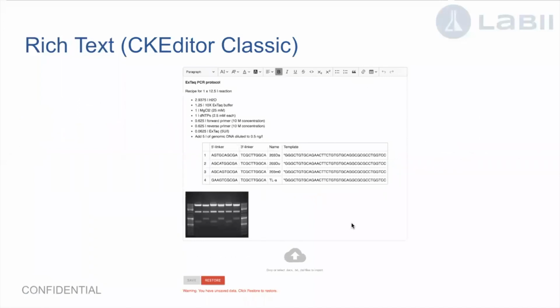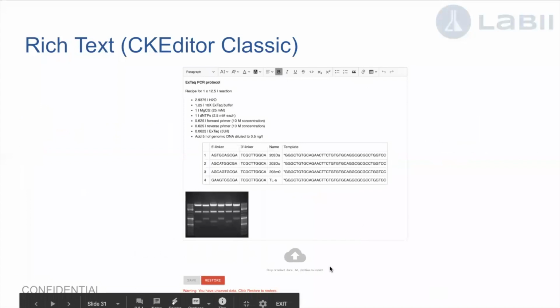Currently we support the CK editor. You can insert tables, you can insert pictures. This is very easy to use. And then you can also drag the Word document or any other document to this cloud icon. The content of your document will be imported to this editor directly.